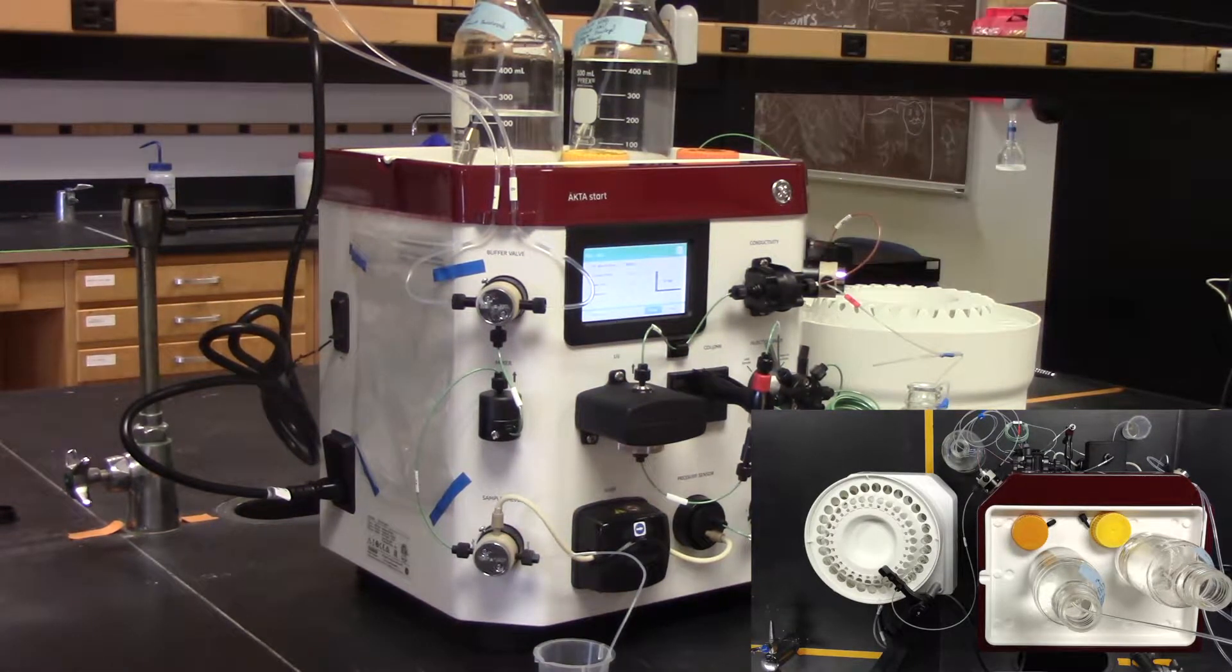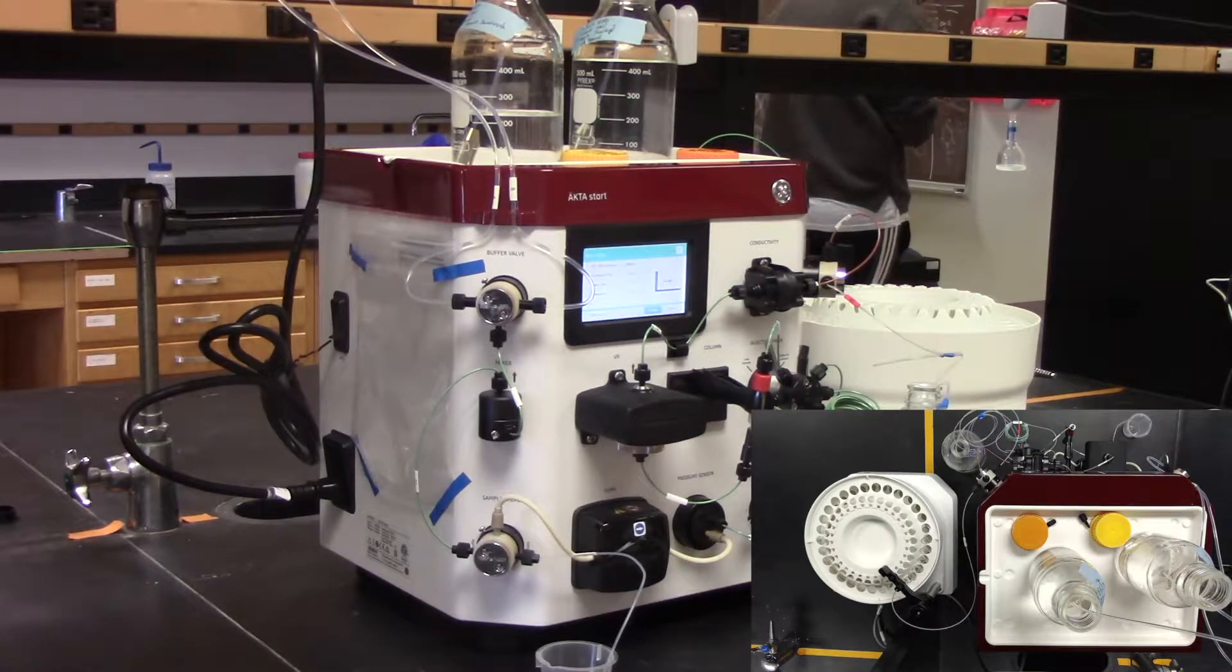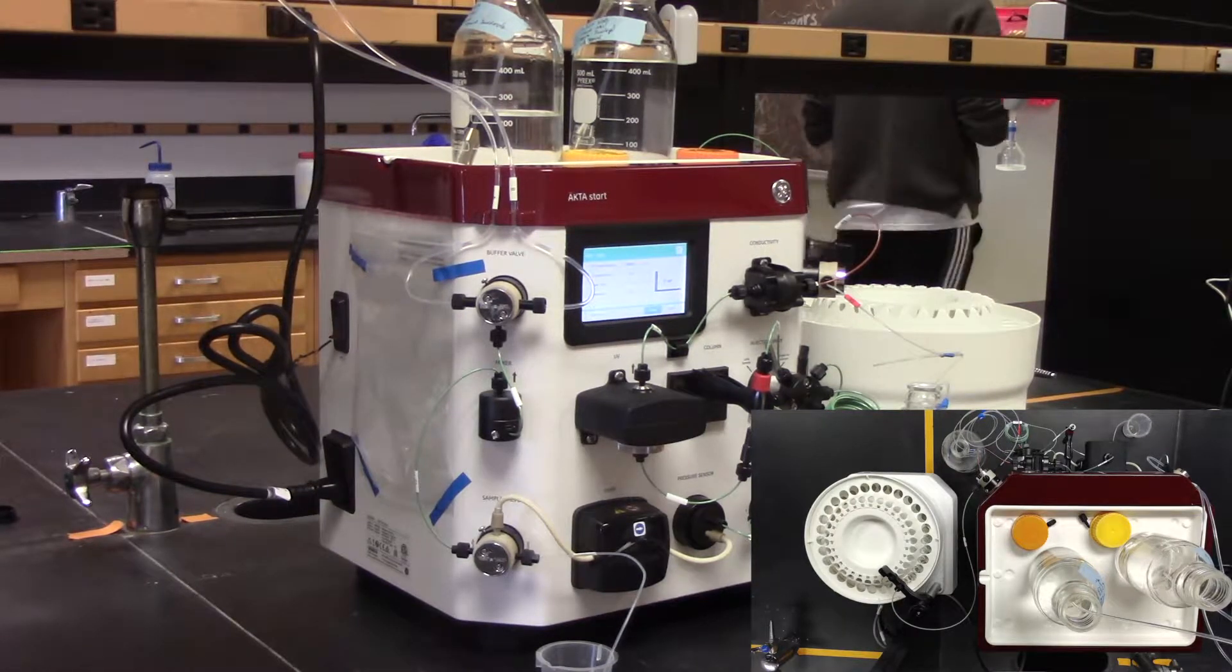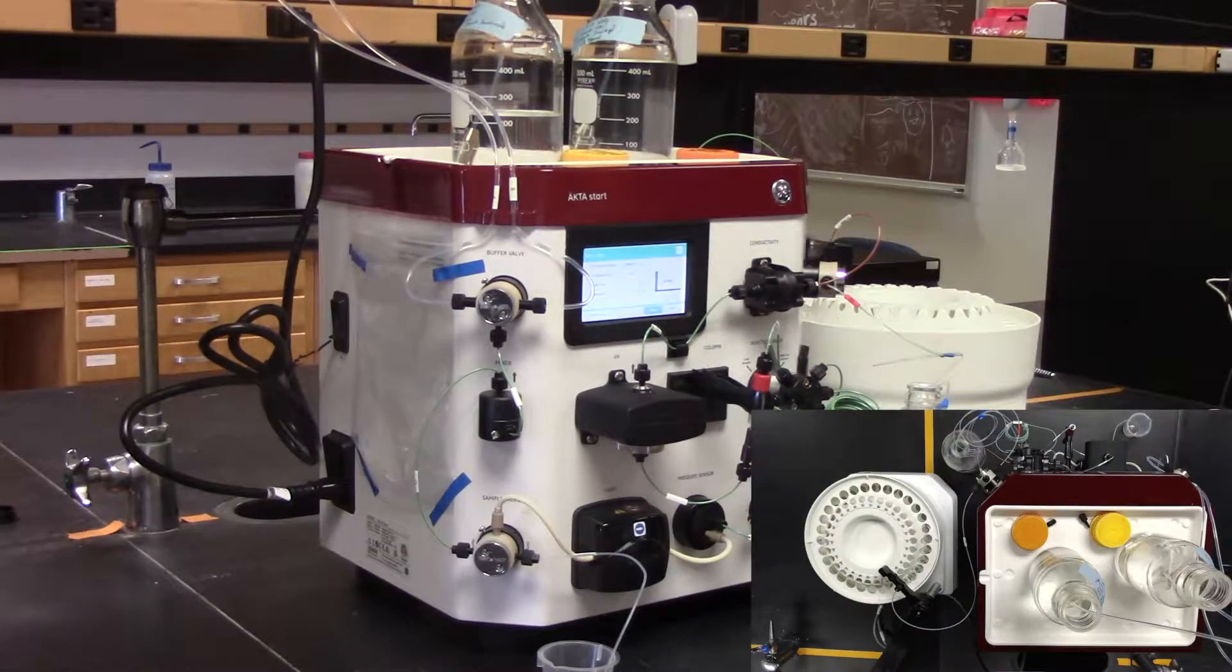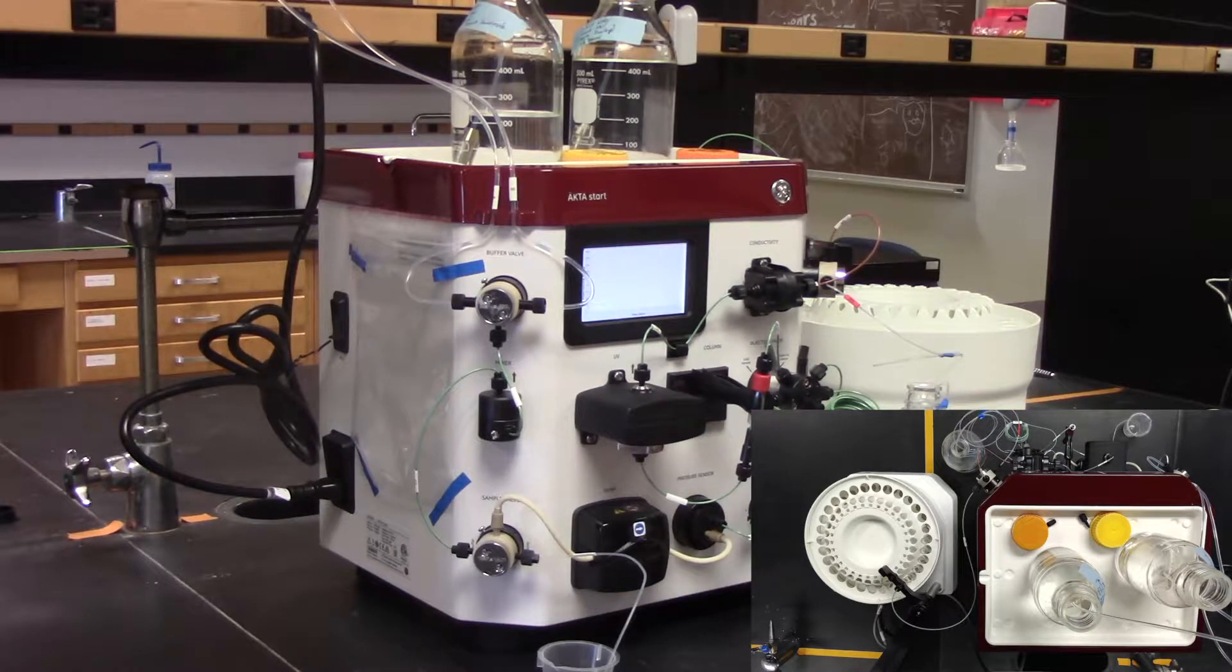Be sure not to load air onto the column. You will have to keep your eye on the amount of lysate that's left. After you have loaded all of your lysate, switch the sample valve so that buffer A or your lysis buffer is flowing over the column. Wash the column for 5 column volumes.